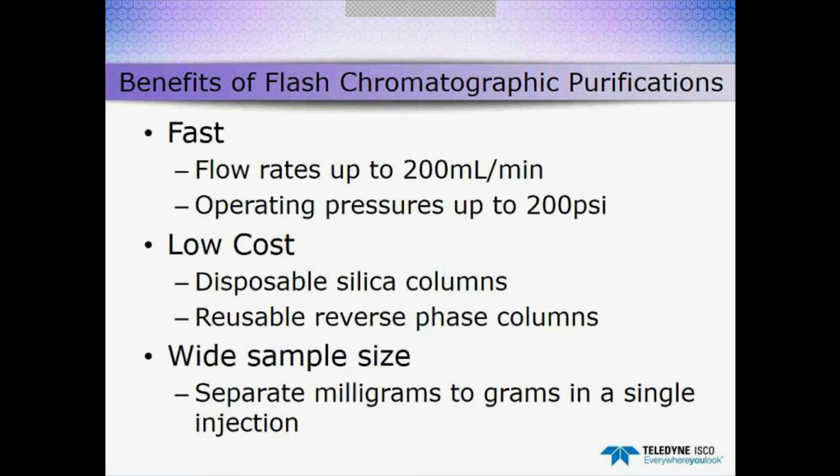The other thing is it's a low cost when compared to HPLC. Columns are disposable if they're silica-based, normal phase columns. They're designed to be a single-use column, and once the purification has been performed on it, it's discarded.